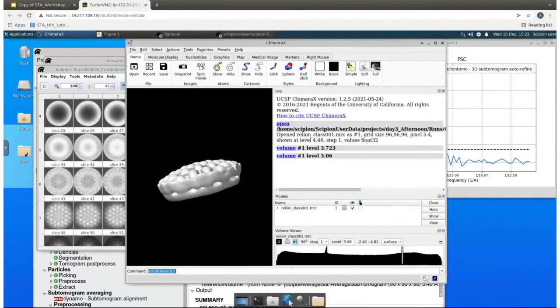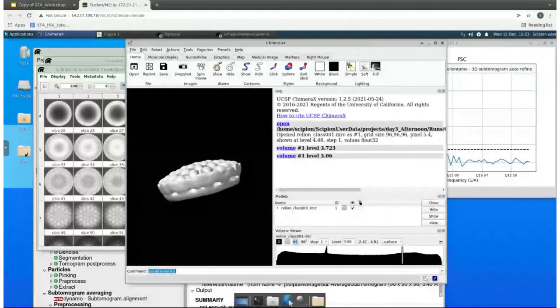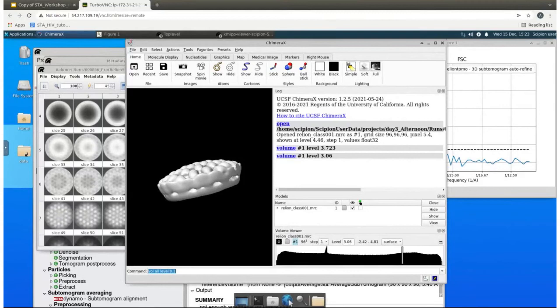Okay. So everyone saw, more or less. Luca has a question. I can read it. Yes, I'm seeing it, Pablo. So if I understood correctly, the auto-refine job takes the particles selected as good in the subset and refines against all the subtomograms aligning. No, it just takes the subtomograms that have been aligned and classified, the good ones, and it improves the alignment. So we select those subtomograms that had already been aligned in the classification and that don't have the fiducials on top, and then we launch the auto-refine so it will improve their alignment. Does it answer your question, Luca?